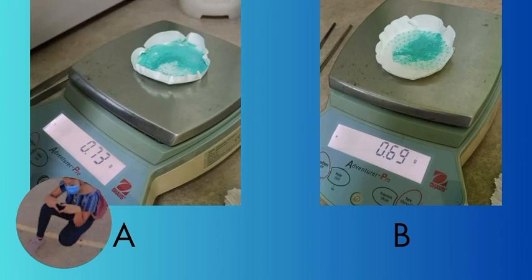Yes, it does have a high yield, and I think one way that yield might be improved is for us to use vacuum filtration for a better recovery, and also to dry our product thoroughly before weighing.